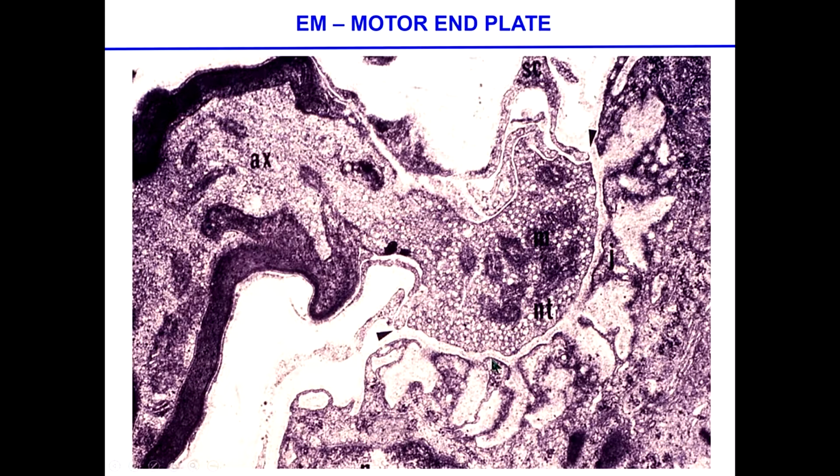This is the synaptic cleft, and as you remember, in the case of the muscle, there are these particular folds, very interesting arrangements of the membrane, and some of the invaginations of that are going to form the T-tubules that will be the first one catching the wave of the signal and transferring that signal to the sarcoplasmic reticulum, where the calcium is going to be liberated. Okay, so these T-tubes that are formed at this level are where the action potential is transmitted into, and how the signal is transferred.